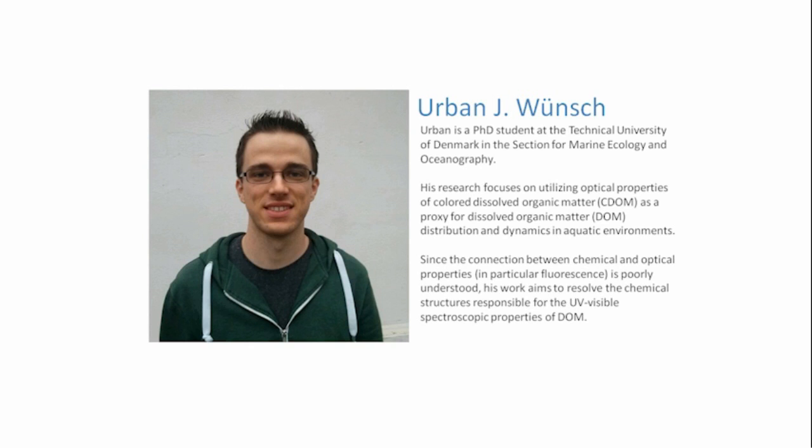Since the connection between chemical and optical properties, and in particular fluorescence, is not well understood, his work aims to resolve the chemical structures responsible for the UV visible spectroscopic properties of dissolved organic matter. He's studying the links between mathematically decomposed fluorescence spectra of CDOM, those of pure organic compounds, and size-dependent optical and molecular properties of dissolved organic matter in various aquatic environments, such as Arctic fjords, boreal lakes, and temperate rivers. Now I'll turn the presentation over to Urban.